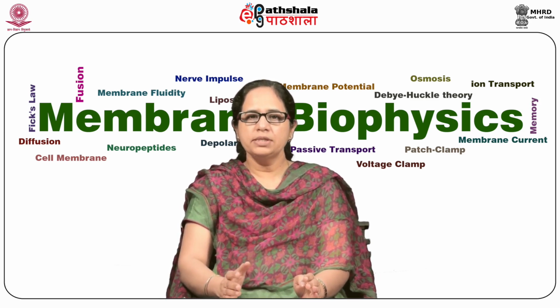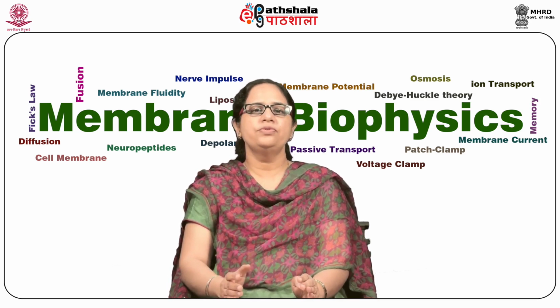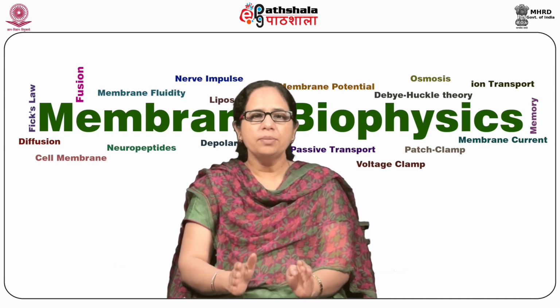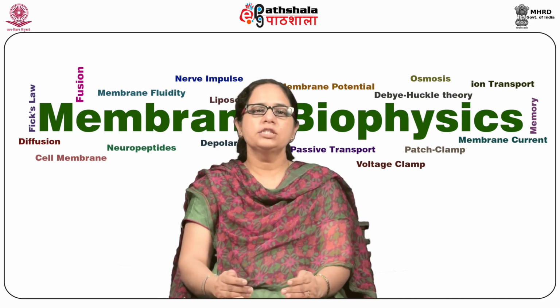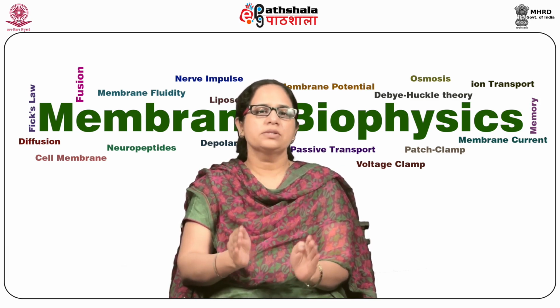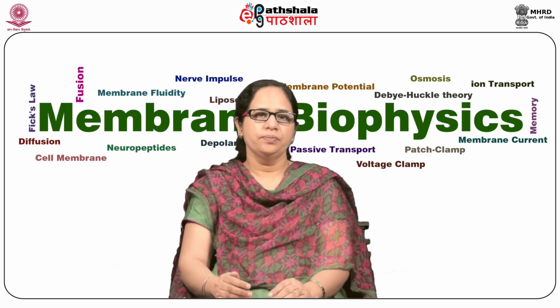Patch experiments can provide comprehensive characterization of drug effect on ion channel function more reliably than any other indirect method. Despite its low throughput in the number of compounds tested, patch clamp is considered inevitable in drug discovery.